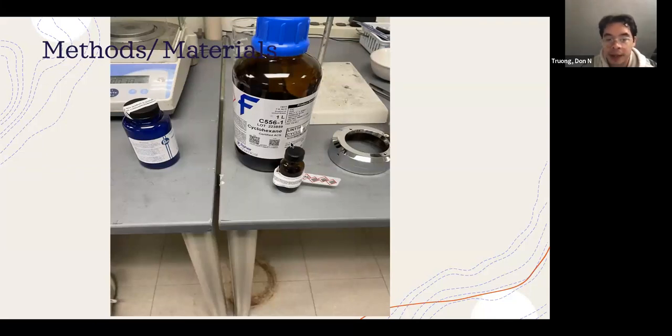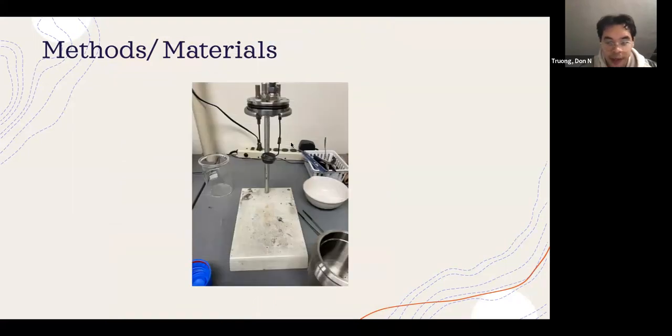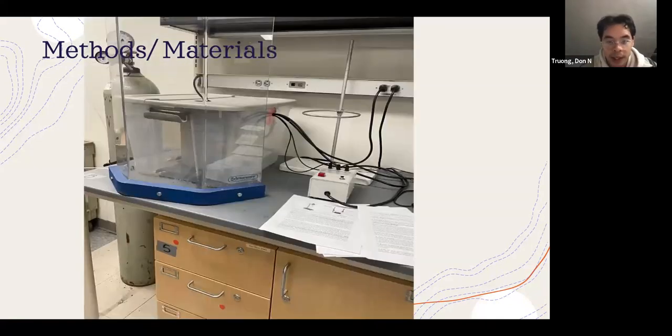Most importantly, the gelatin capsules that were required for the cyclohexane samples. Next up shows what we did. We measured an ignition wire and connected it to the bucket with the sample in the bucket, and we're able to load that into the calorimeter as shown here. We connect the temperature probe as well as a stir. The temperature probe helps us find the temperatures at various times. Then we add around 2 liters of water. We pressurize the bomb, and it is ready to go.